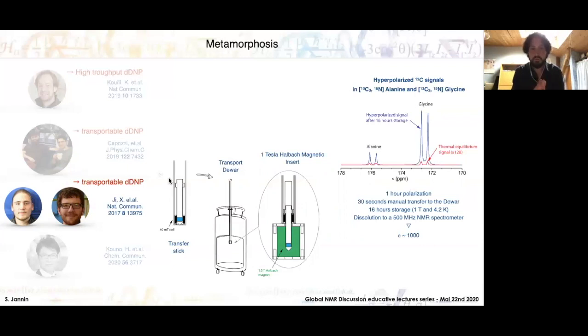So you need to have a microcrystals formulation with hydrophobic solvents that are actually toxic, or you need to have very small sample irradiated with UV, and the ability to create the right radical depends a lot on the sample. So what we are working on right now is to try to find a way to polarize virtually any sample, any molecule, any mixture, any complex mixture.